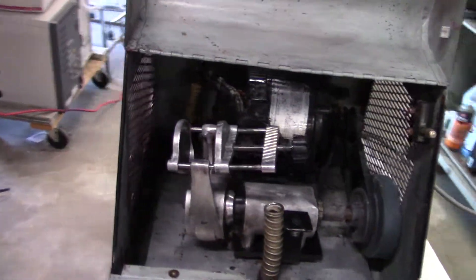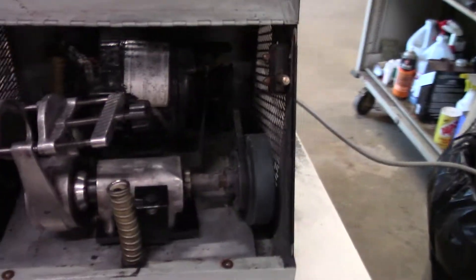Hi, this is Jim from HitechTrader. We're looking at a Spex ball mixer mill, model 8000.